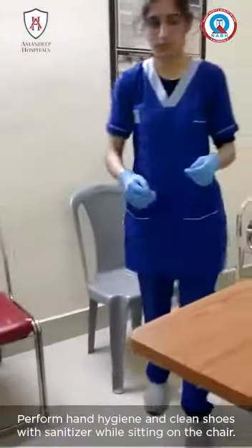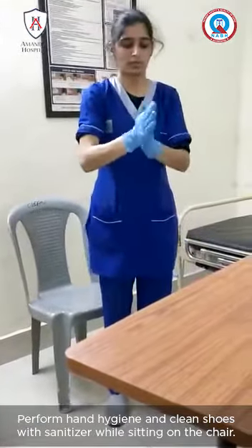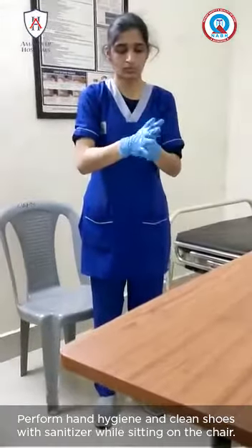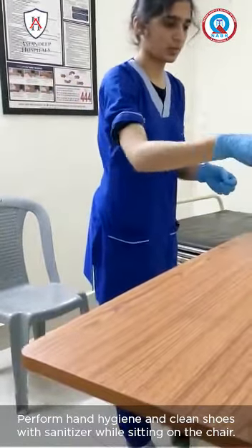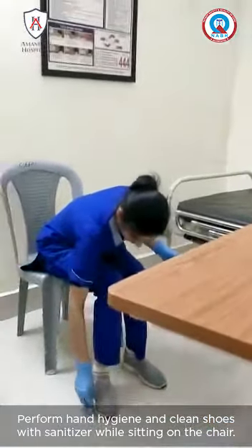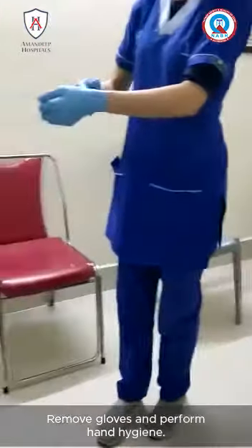Perform hand hygiene and clean shoes with an alcohol swab while sitting on the clean chair. Finally, remove gloves and perform hand hygiene.